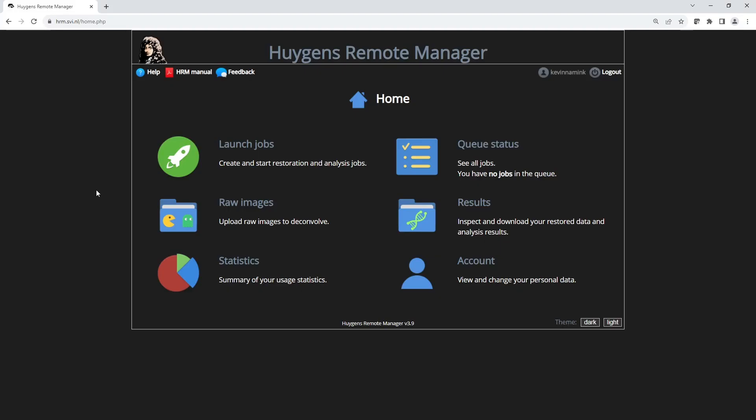Now I will talk about the HRM or Huygens Remote Manager. The HRM is a web-based interface to use Huygens. You send the images and a set of instructions to the server machine and it will do the processing. You'll get an email when it is done and you can then download the result image.